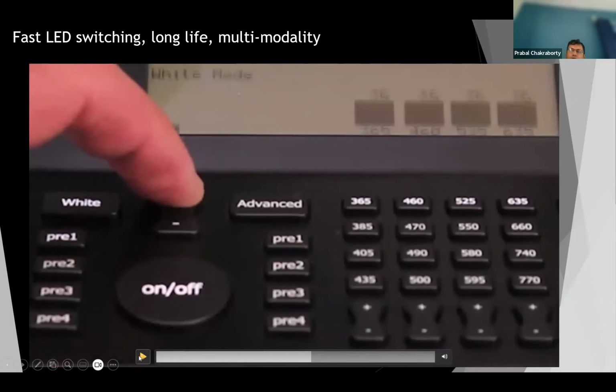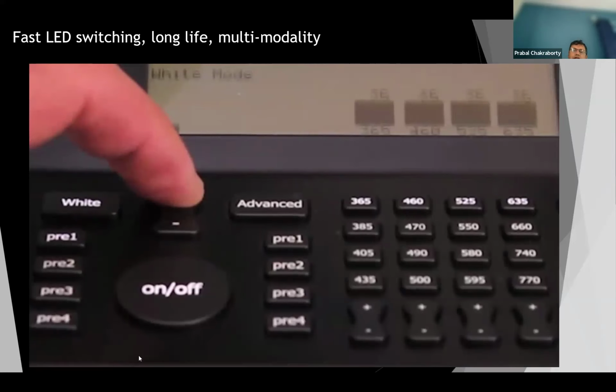So here you can switch on all 16 LEDs to have a white light, which you can use for some purpose, or you can individually switch on different LEDs to have different colors. All these options are possible, and the switching time with the new LED illumination is in microseconds. So you can understand how fast you can switch the different colors of the LEDs, and how fast you can do the imaging.